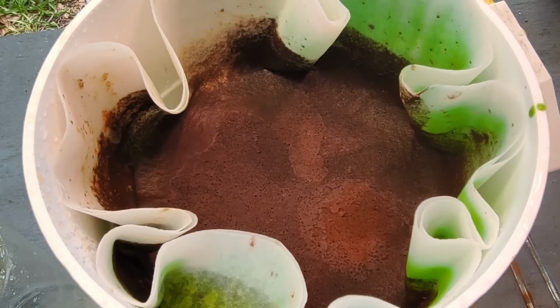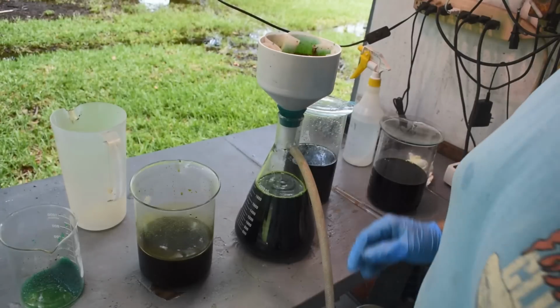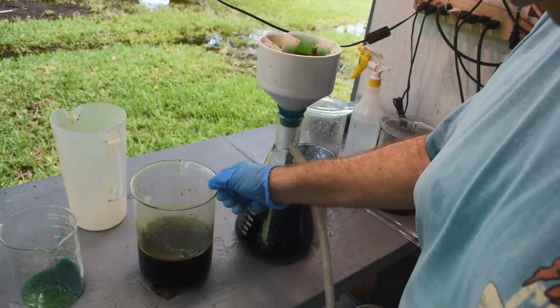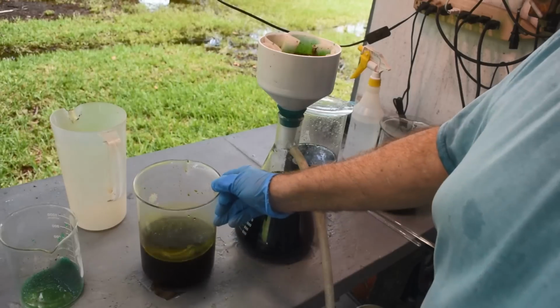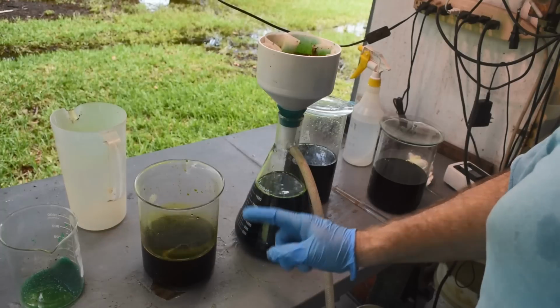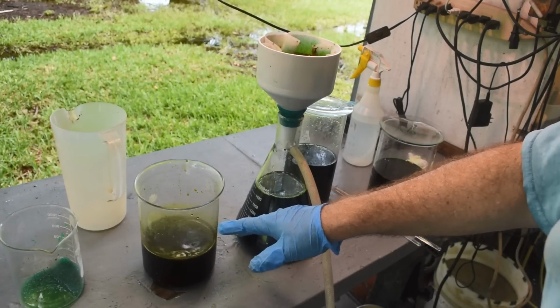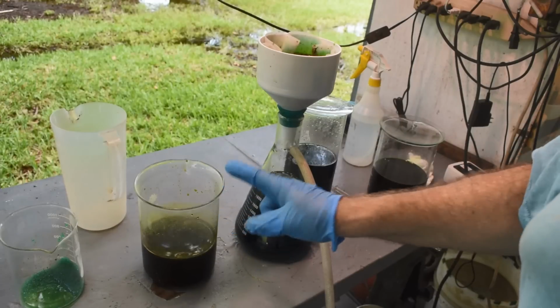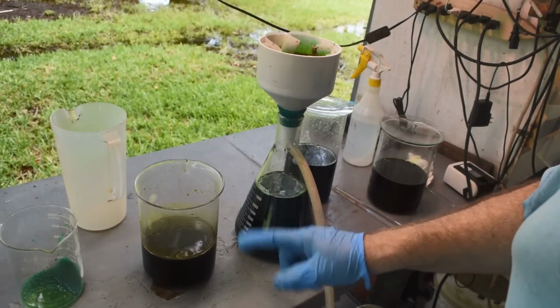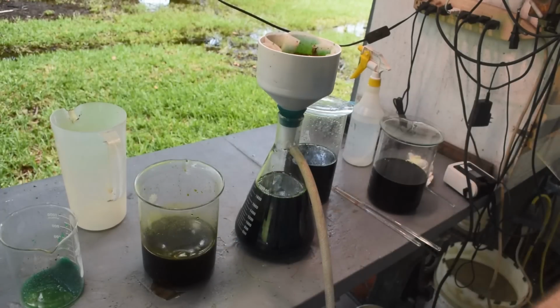Things are going swimmingly. I've been filtering the second one I did, and I'll tell you what, there's a lot more red stuff in here than I thought. A lot of it's sunk to the bottom. So it's good to know that if the liquid's a little more dilute, the reaction's a lot less vigorous, but it happens nonetheless. Don't be fooled into thinking it hasn't happened. Just look for red stuff. It's there.